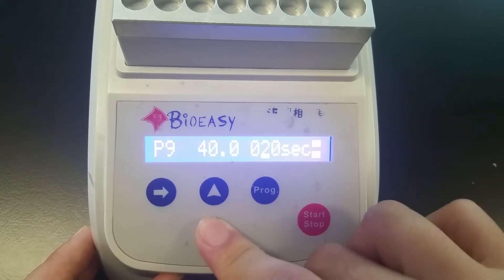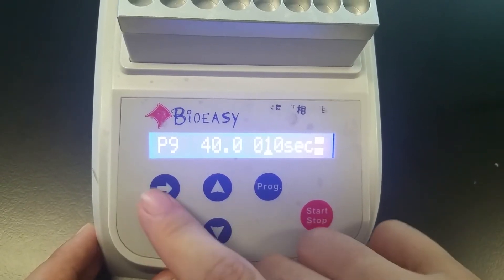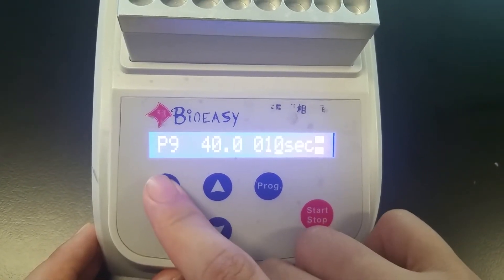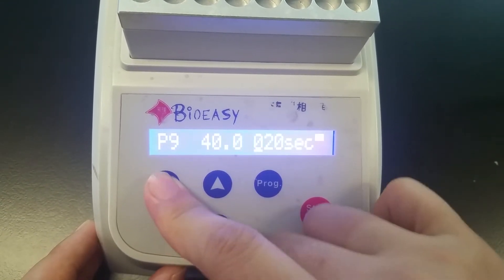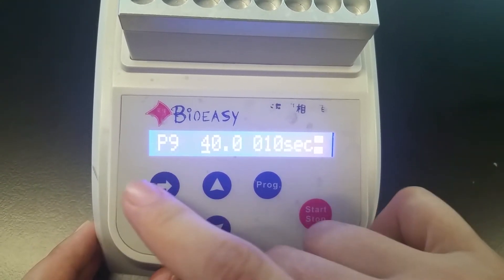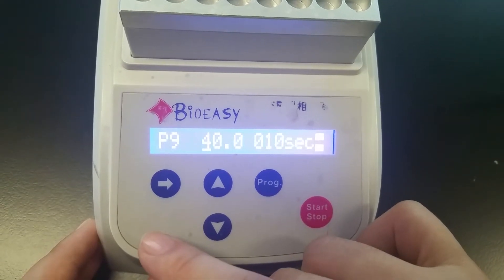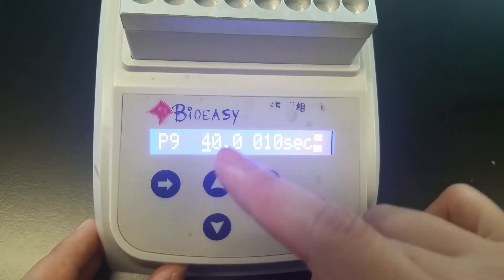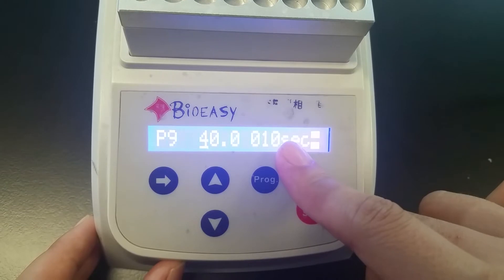For example, 10 seconds. And move the left button further. So now the second round incubation time and temperature is done: 40 degrees and 10 seconds.